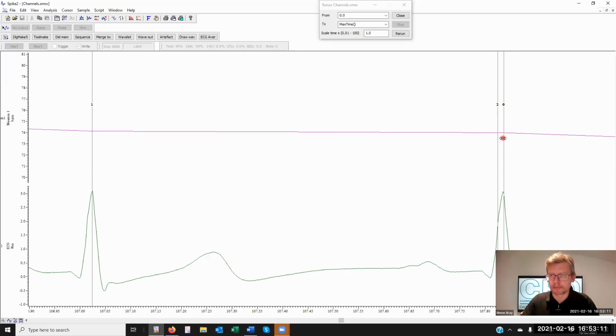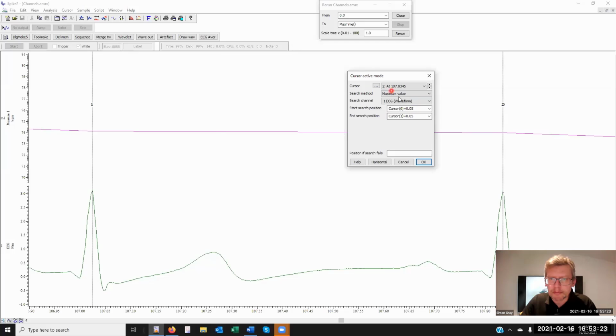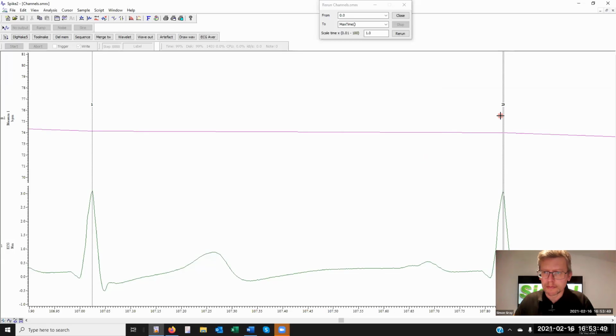Oh, you've got to be joking. Right, so that's an error too. So I need, right. Okay, maybe I'm rushing. So I started search. Okay, let's do this. It's cursor 1 plus 0.05 to cursor 0 minus 0.05. So that wasn't logical before. There we go. So sorry about that.